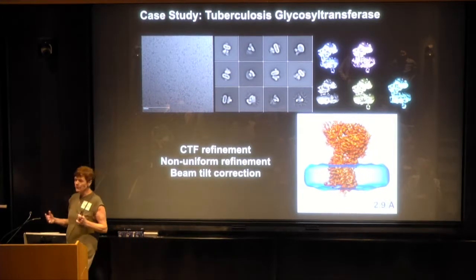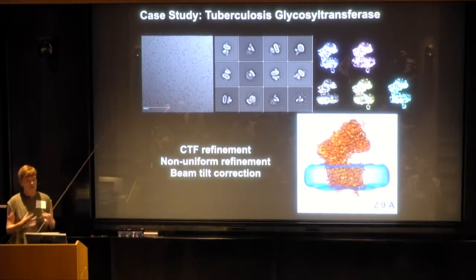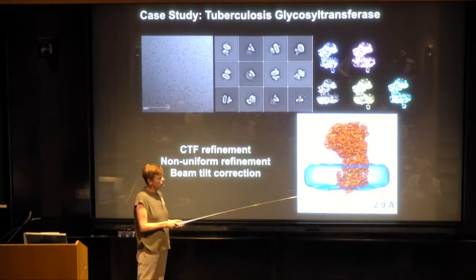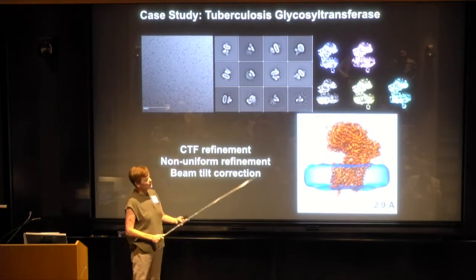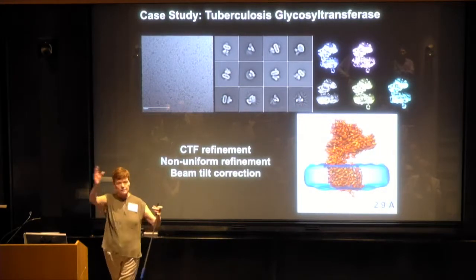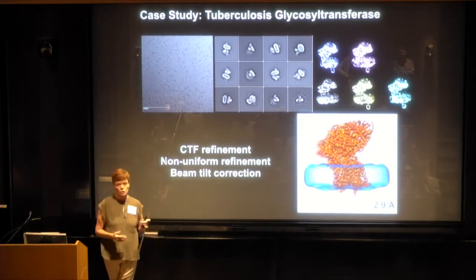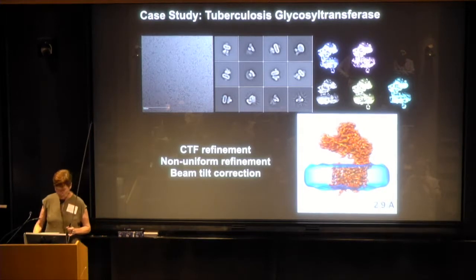Not only have we maybe thrown a lot of data away that we need, but we've missed a story too. Because many times, as all of the people doing cryo-EM will know, less than 10% of the particles that we started with end up there. What is the story in the other 90%? Is it some fabulous manifold story like Joachim's telling, or is it just garbage and junk that we have to discard? We don't really know that yet. So that would be good to know.